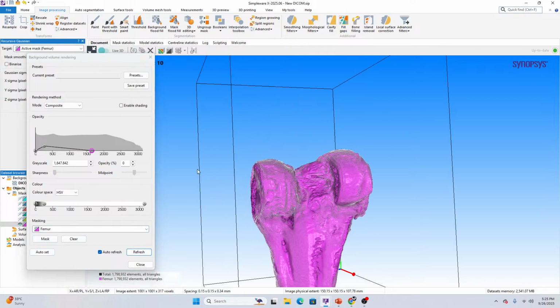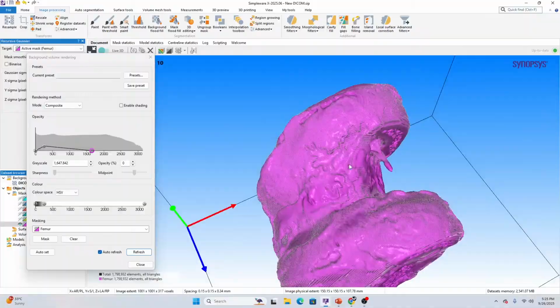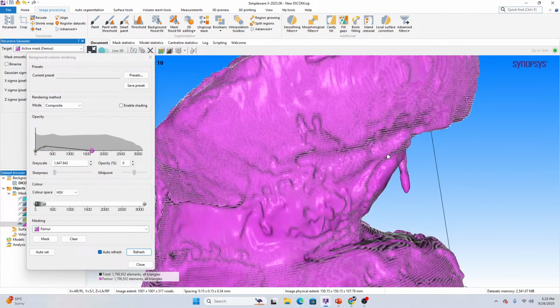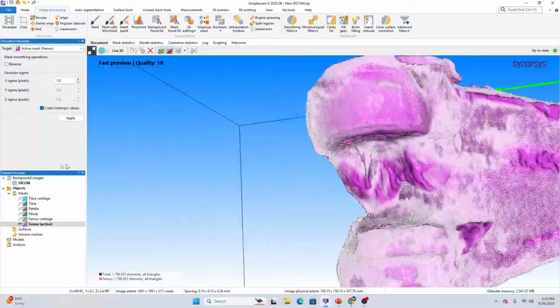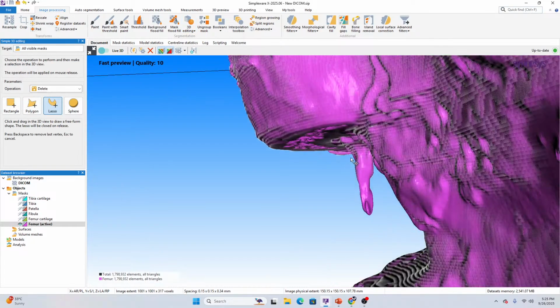Once the mask is selected, we can see that it's almost marking up the particular volume rendering of the data set. At some point, it also has some region to be marked out, so we can at any point remove this. It's some artifact due to which the particular defect got created. We can anytime remove it using a 3D editing option. So we will just go over here in the simple 3D editing, and we can easily apply a mask operation to remove this particular part.